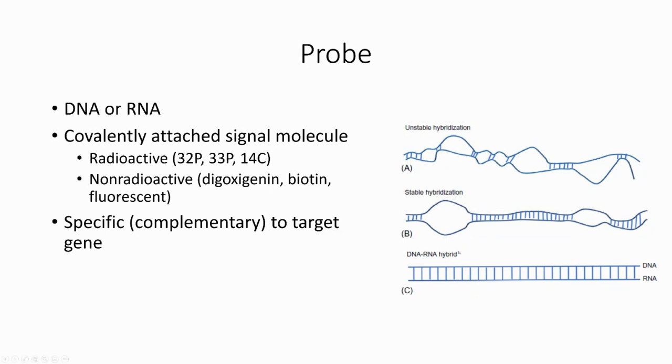We base it on the complementary principle. So the probe can identify and find the complementary region and bind it, so that it gives you the signal.